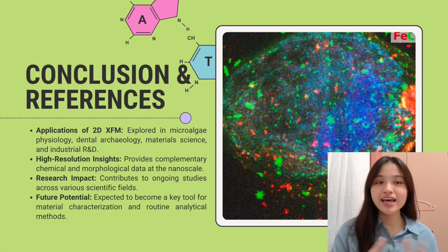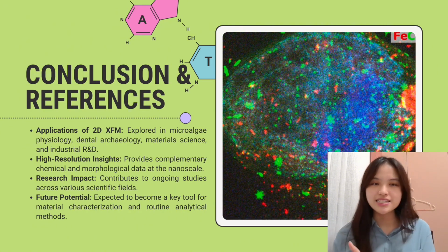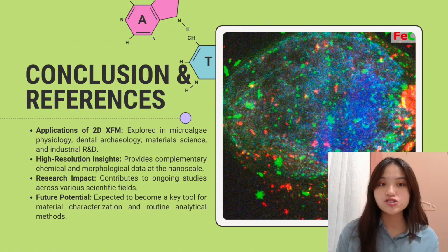In conclusion, XFM is transforming scientific research by providing detailed insights into material composition and structure. Its applications in biological and material science are driving innovations in drug delivery, biomaterials, and sustainable manufacturing. With its growing adoption, XFM will continue to push the boundaries of scientific discovery.